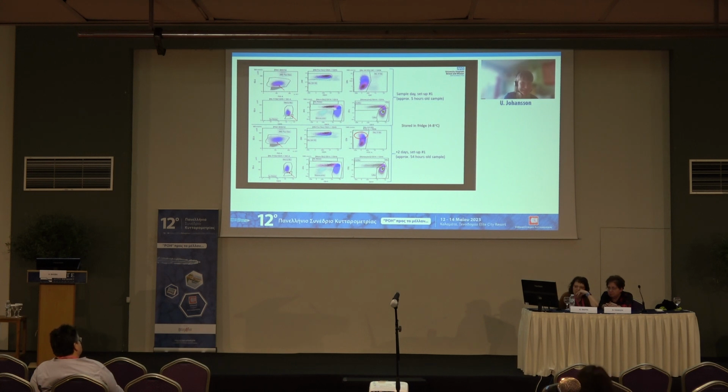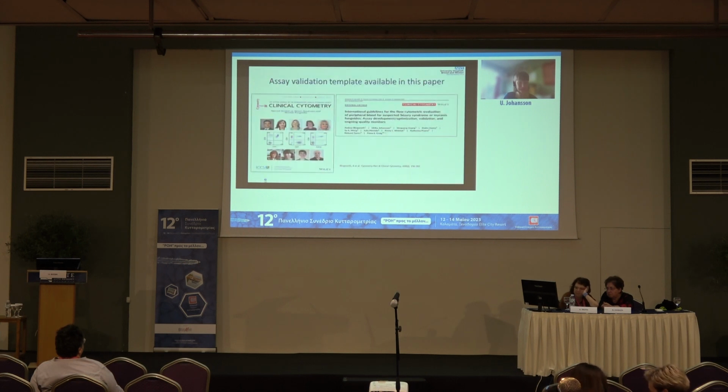I think what happens here is that these are the CD16 positive non-classical monocytes that are found there, whereas after a little bit of time they're less clear and lower their side scatter a little bit. That's the main finding there. But we can still pick them up, and at the end of the day, it might be slightly suboptimal, but the readout is the same.